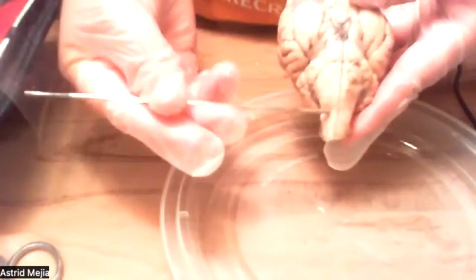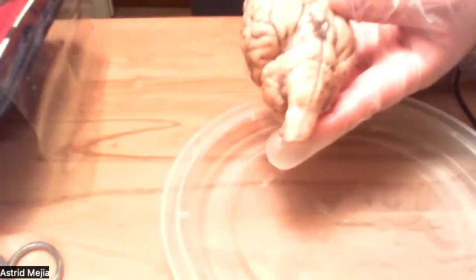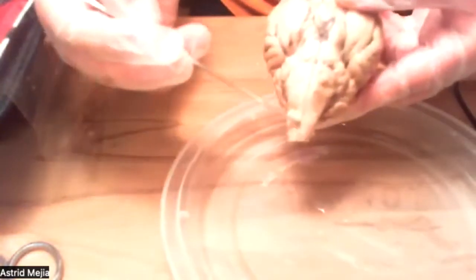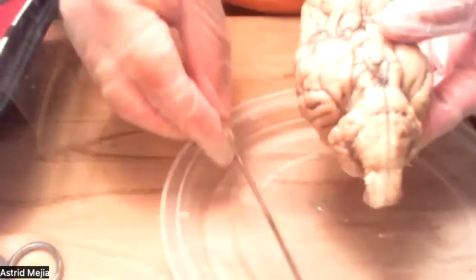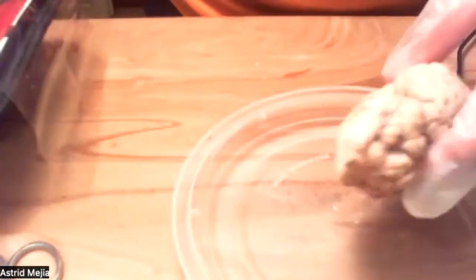And then you can see the spinal cord as well, which would be the end right here. It sends motor commands from the motor cortex to the muscles of the body and sensory information from the afferent fibers to the sensory cortex.